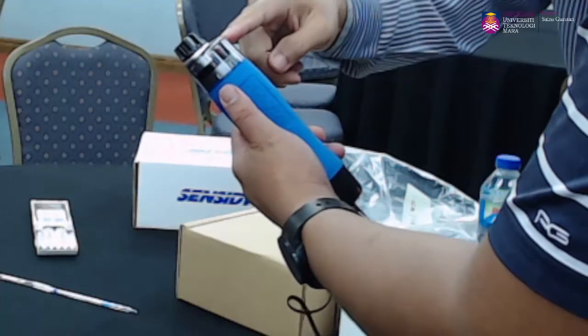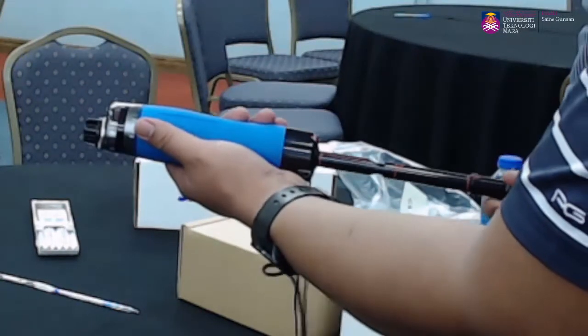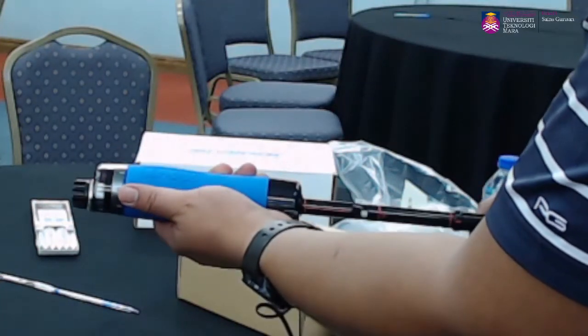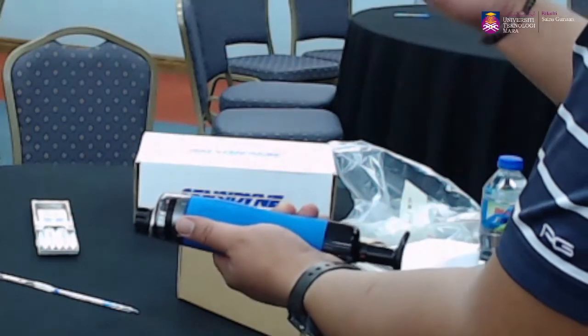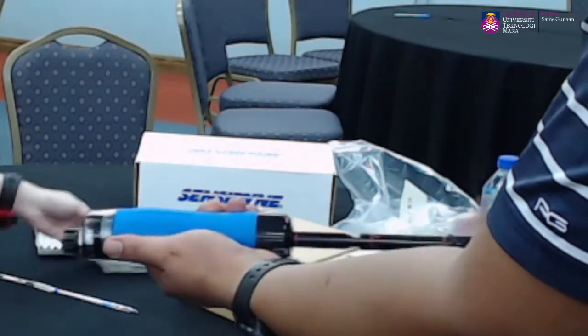Sekarang ni kira ni sebab saya tak pasang PO, so kita buat kosong lah. Kita buat dulu macam ni, from the first, initially break the tube balik. So kalau kita nak turn tu, kita dah unlock dia. Kita dah move to the side, tolak balik ke dalam. Dah kira satu kan tadi? Dia dah keluar indikator. So kita turn balik, kita tarik sampai habis. Second stroke.